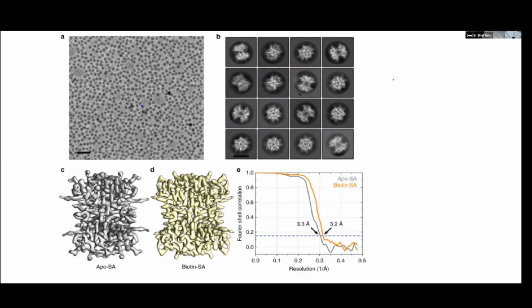And then, although this is only a small image of this material, the computer system is able to extract from these images then the essential elements that end up giving this kind of image of the protein itself. Okay? And so this is a stage in which we're now able to follow more or less the electron shells of the side branches of the amino acid chains.